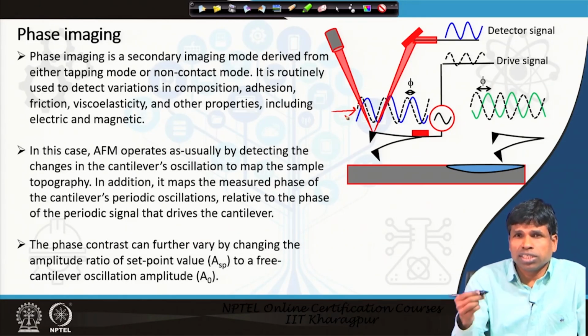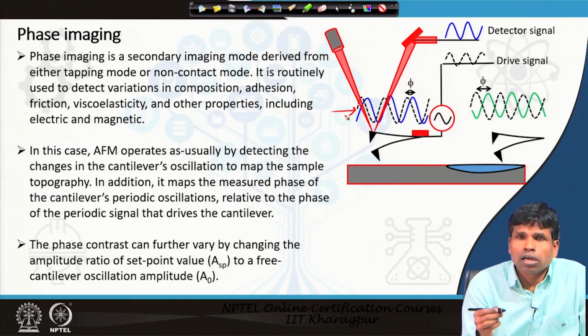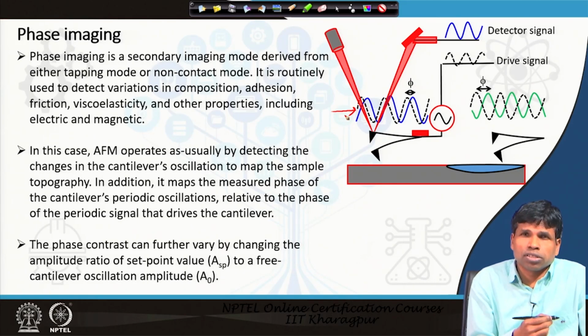That amplitude we can change as per our requirement, and that can be changed by choosing a suitable type of cantilever with a different value of spring constant.